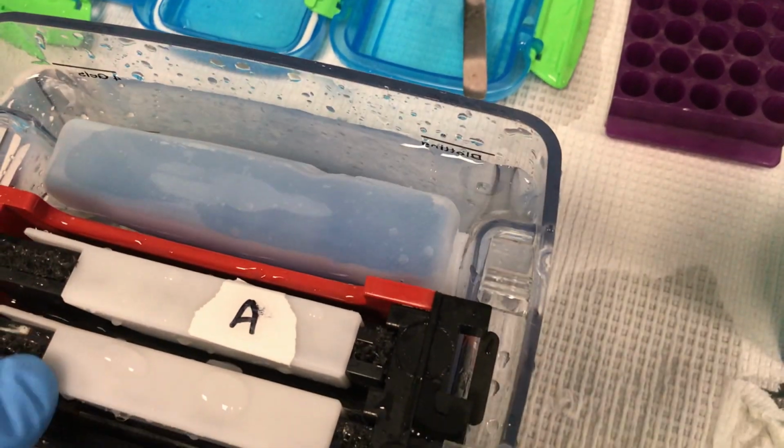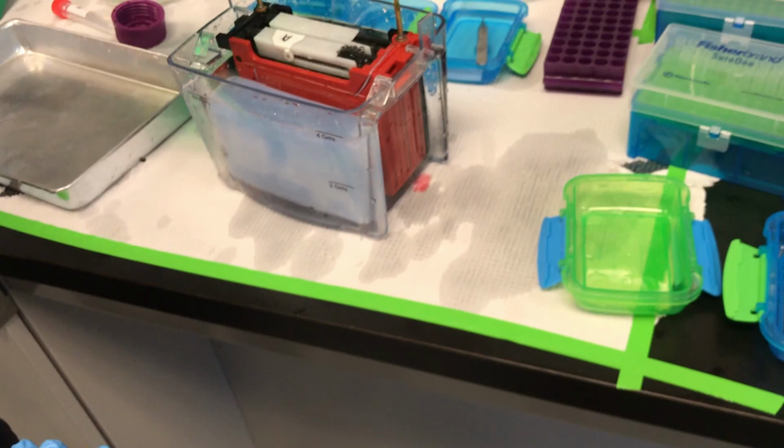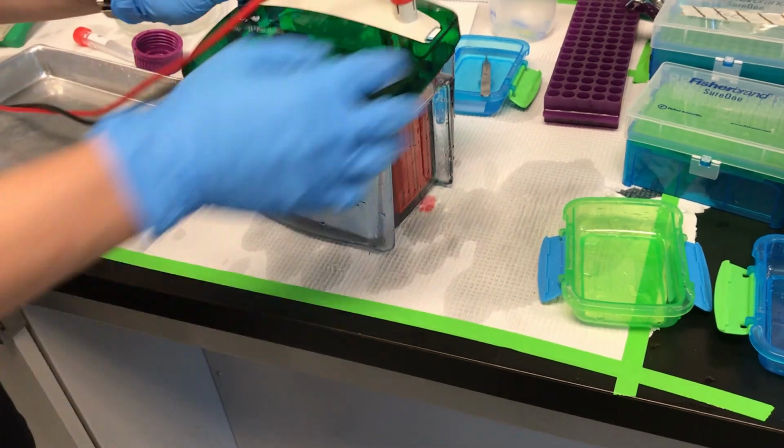So here I'll turn it over. It's like the ice pack's there to keep it cool. Put this on.